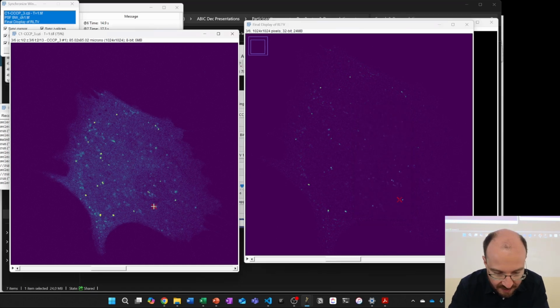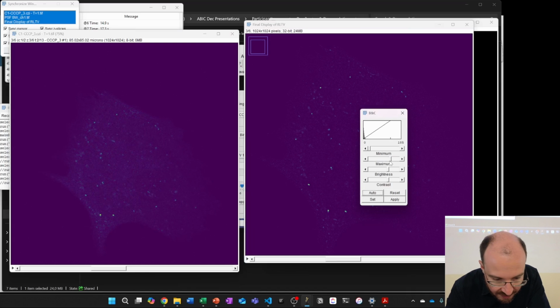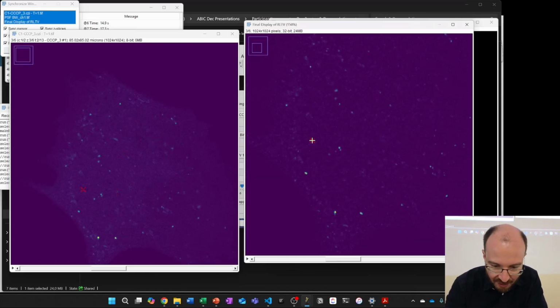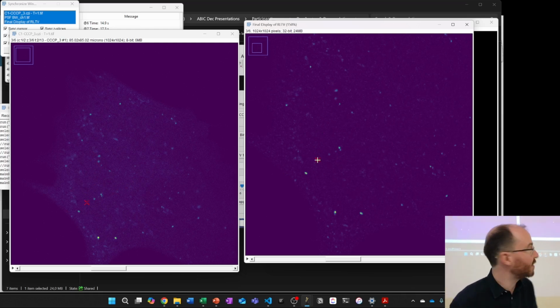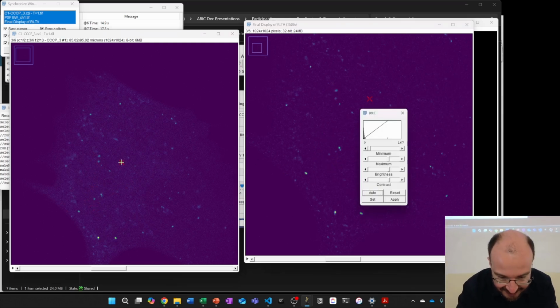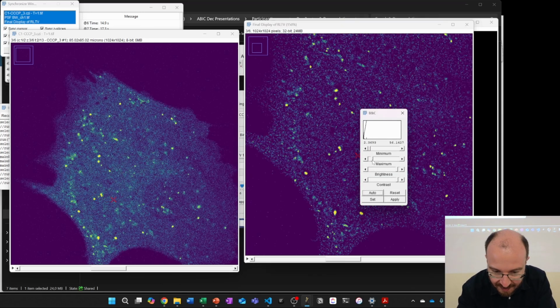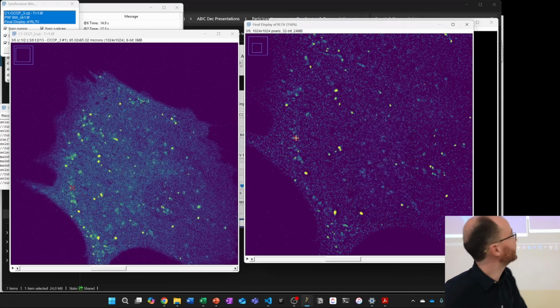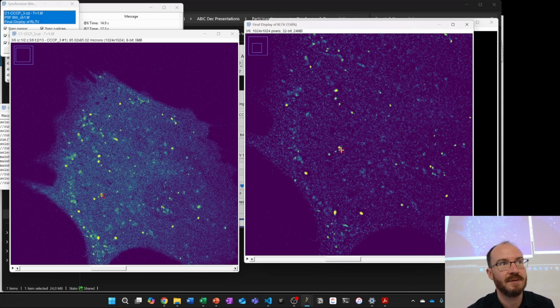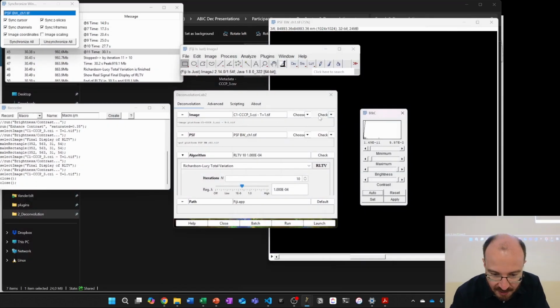And then here, a similar approach. Make sure that it's not that saturated. So hopefully you can see that a lot of this blurriness, fuzziness that was there, if you're on this screen, but if you maybe just, I'm going to exaggerate this to make it a bit more clear. But a lot of the fuzziness is actually now gone. And that's exactly what we were hoping to see with this deconvolution. All right, so let's just do the other one to wrap this part up.